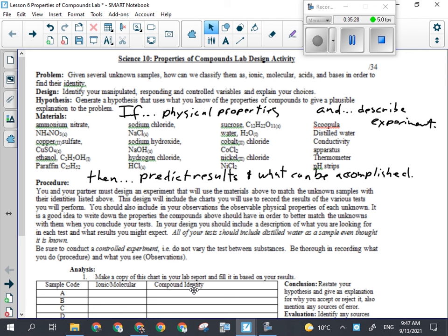That's all stuff that should go in the procedure. Cleanup is part of the procedure, so tell them what to do when they're cleaning things up. Otherwise, people might put it down the sink, and we don't want that stuff to go into the sewer, or the plumbing in some cases.